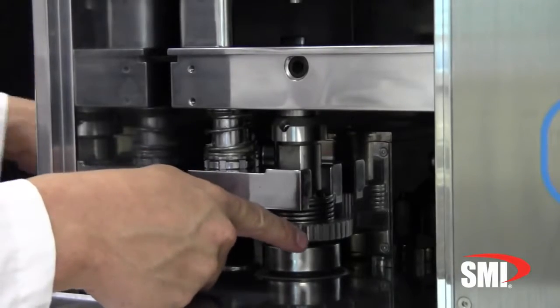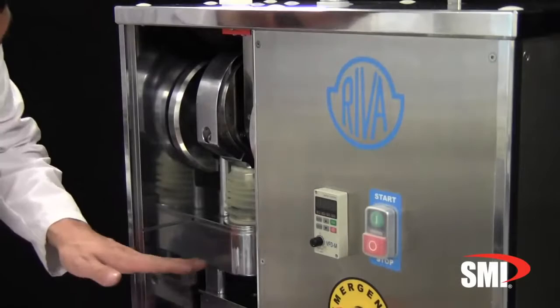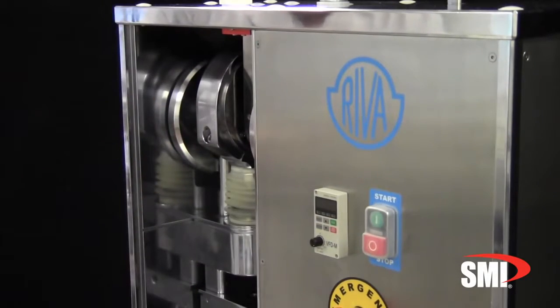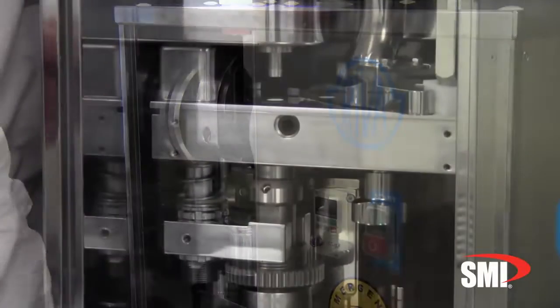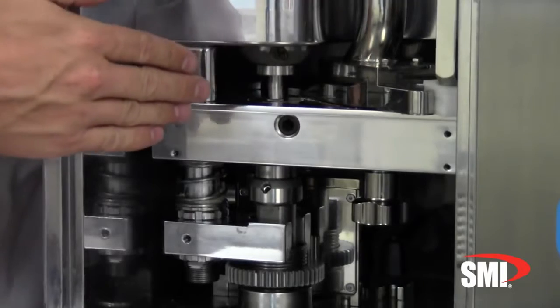With SMI's stringent calibration and design services, the machine compliance correction factor will eliminate any machine structural deformation error, allowing a true and accurate measurement from the displacement sensor. The MiniPress compression area is compact, resulting in a small correction factor, but is still necessary for reliable and accurate data.